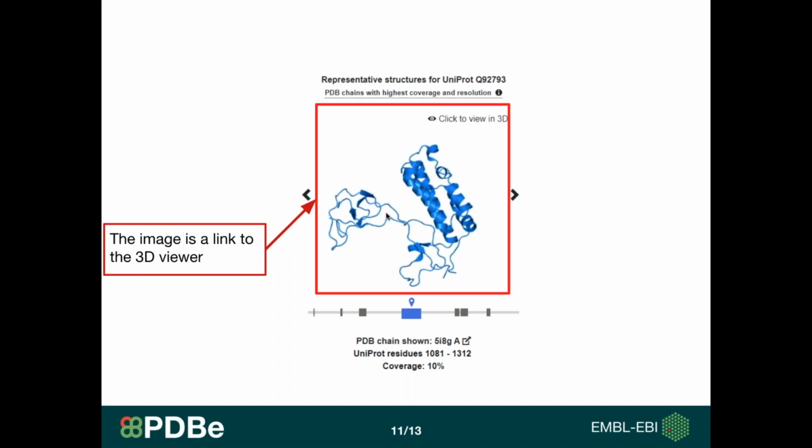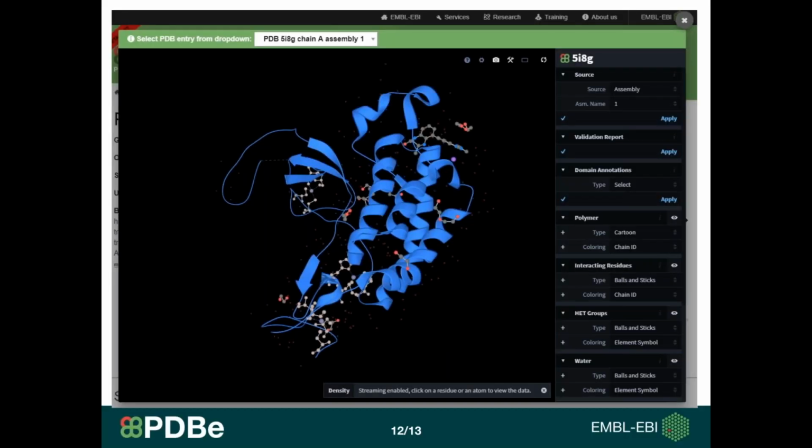If you click on the image itself, then it will link to a 3D visualization tool, Mol*. And this is an interactive tool where you can get into the details of the structure itself.